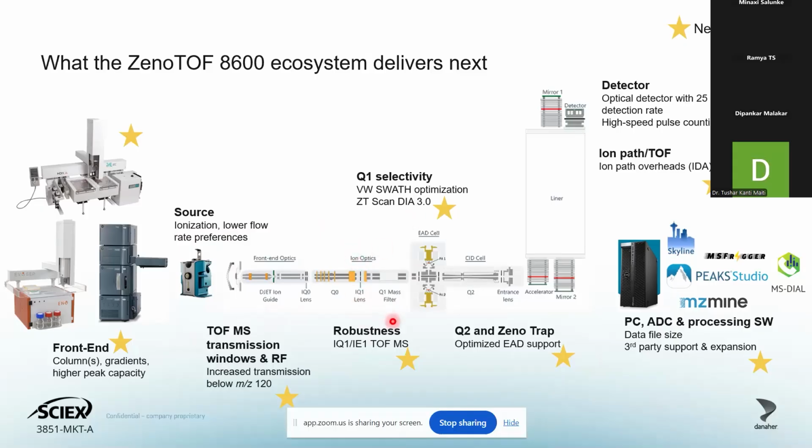Then we have a Q1 mass filter followed by the EAD cell, which is the electron activated dissociation cell. Then we have a CID cell, and then the time of flight analyzer. It's an N-shaped time of flight analyzer. Then this is the detector part. So this is all about the 8600 system.